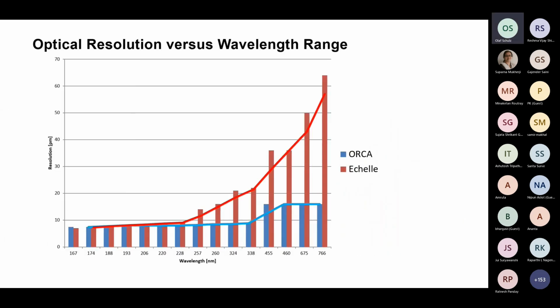A major difference between echelle and Paschen-Runge type optical systems is their behavior in terms of resolution and stray light. The diagram compares the two designs here. While there's little difference in the 200 nanometer region, with the echelle spectrum the resolution drastically worsens above 250 nanometers, since those wavelengths can only be accessed in the lower orders.